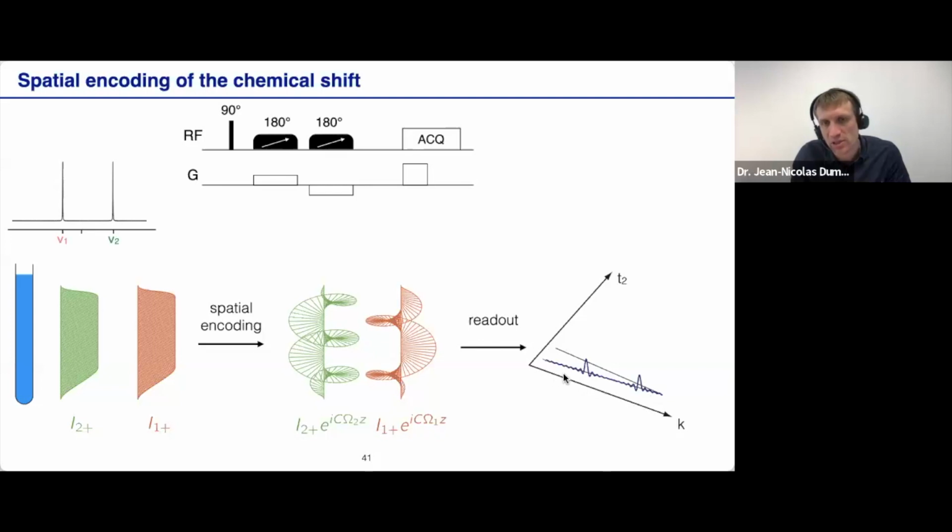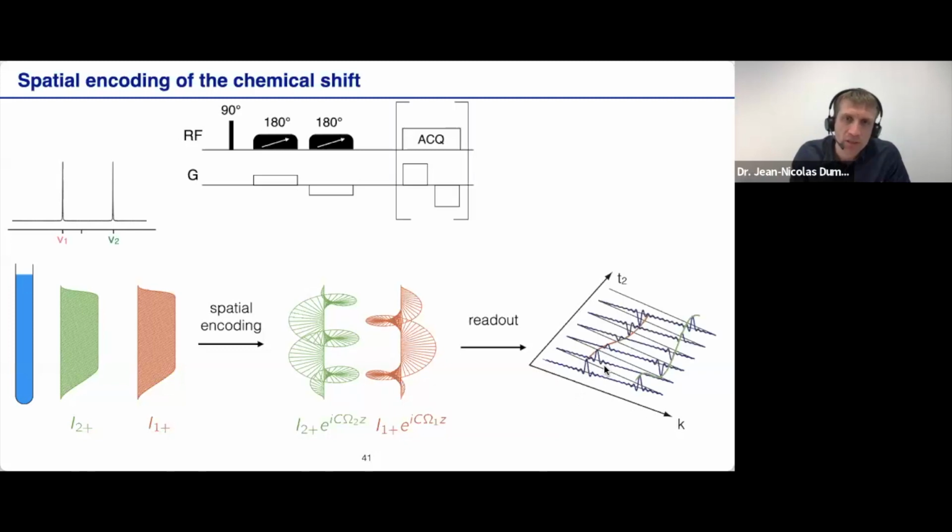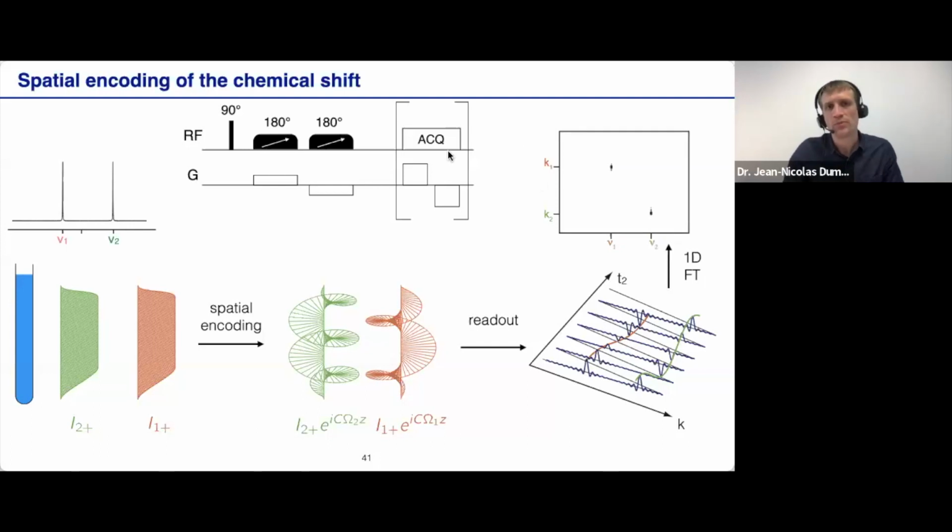So the indirect chemical shift dimension is obtained by the application of a readout gradient. Because this process is reversible, it can be done and undone numerous times. Meanwhile, the NMR interactions modulate the signal in the direct dimension such that the Fourier transform gives the 2D spectrum. And now one can include a mixing scheme to also obtain correlation information.